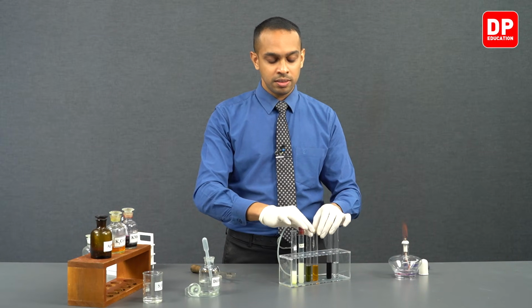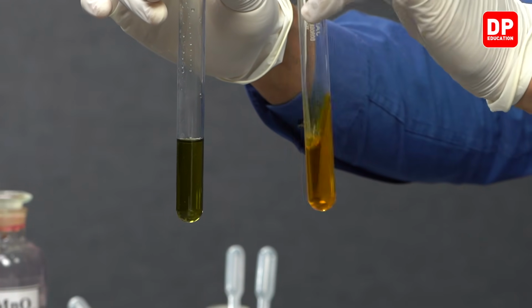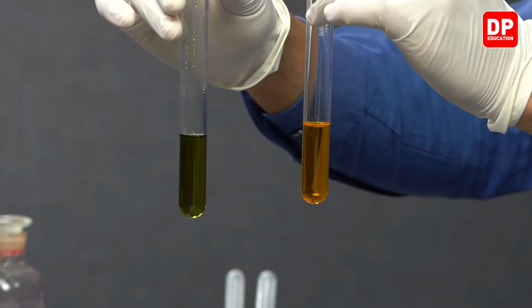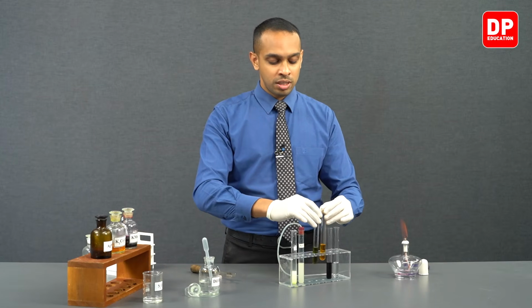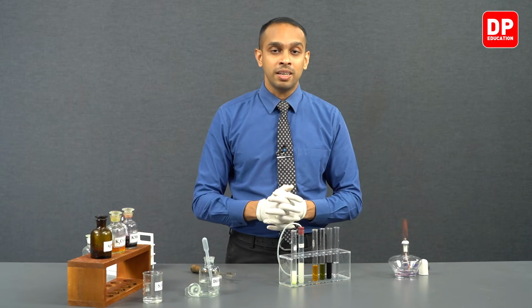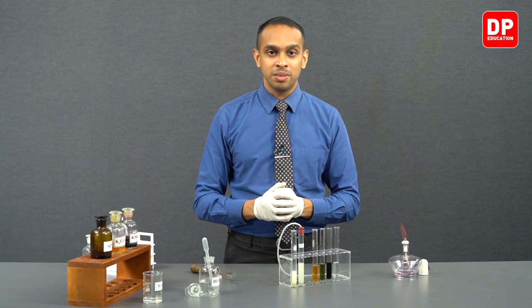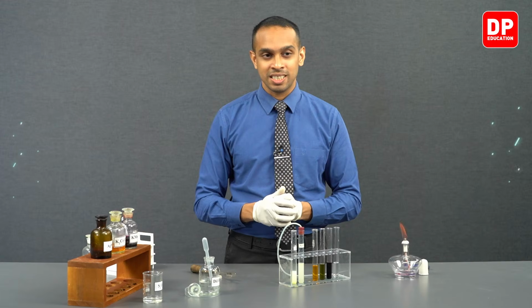When we send sulfur dioxide through acidified potassium dichromate orange solution, we form a green chromium 3+ ion solution due to dichromate ions reducing while sulfur dioxide oxidizes to sulfate ions. Now students, these are the tests that can be used to identify the presence of thiosulfate ions in an aqueous medium. Now let's move on to the next test.